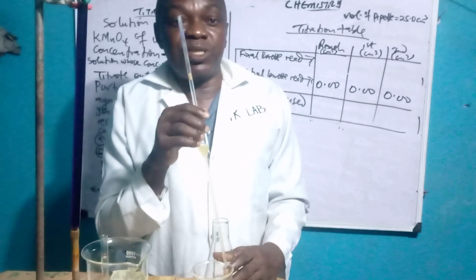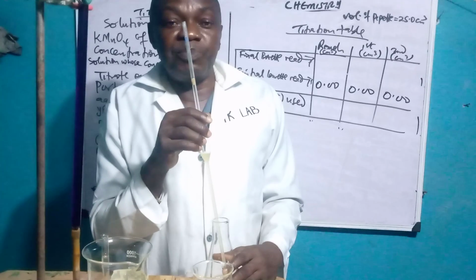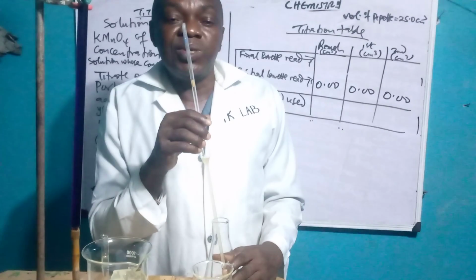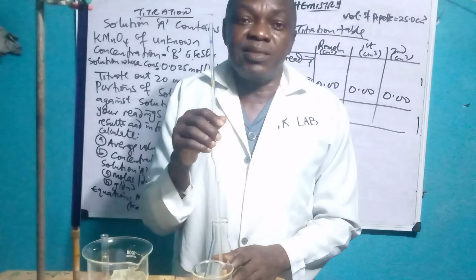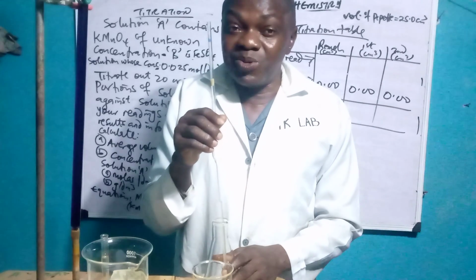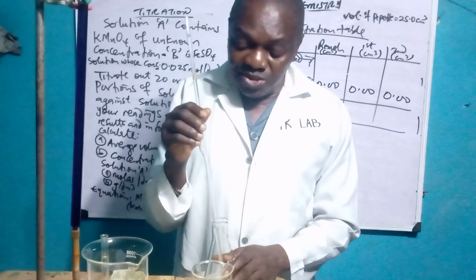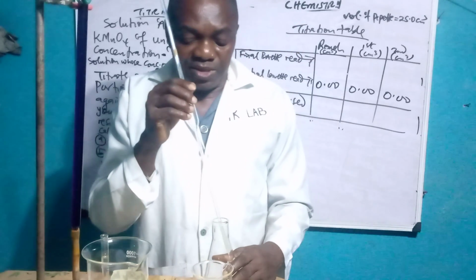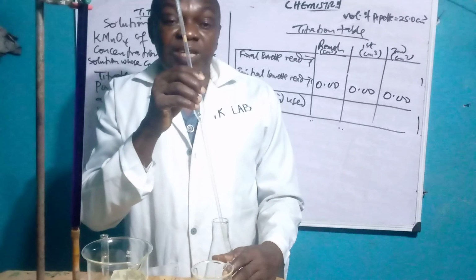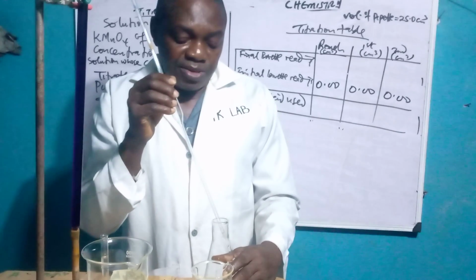Because if I have, let's say, 22.0 or 15.0, and the one your school is using is about 30, and you use 15, you get 0. That 11 mark, which is almost a bonus mark, 8 marks out of it is already 0. So don't fall into that mistake. Use whichever one your teacher uses in your school, or the way he teaches you to get your endpoint.